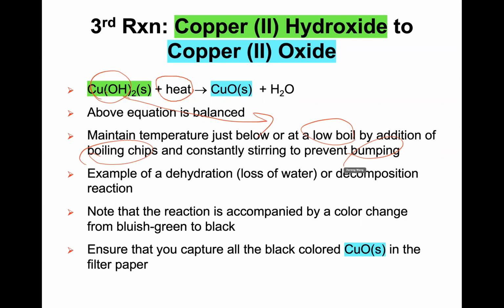In this case, you can see the color will change to black. Once you see the black, heat a little bit further. Now, this is fully converted to the copper oxide, right?